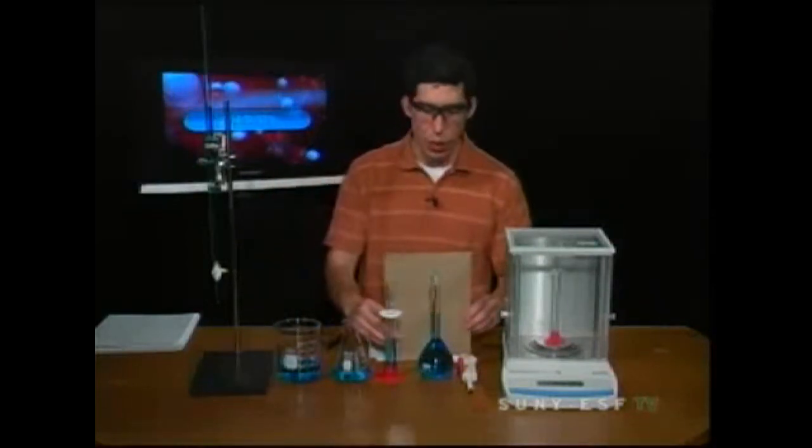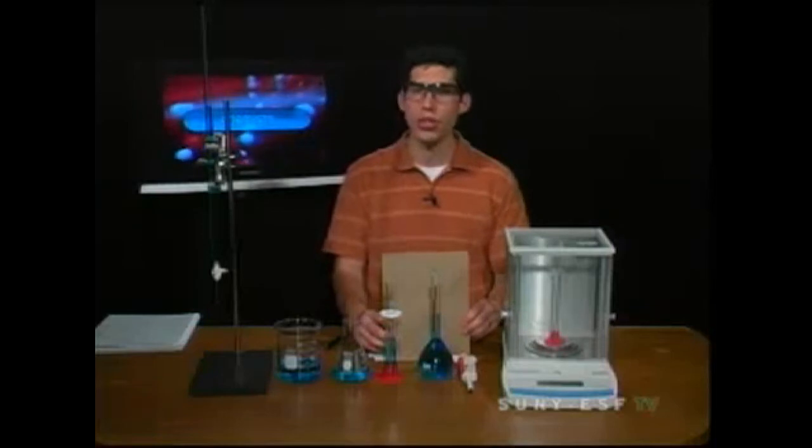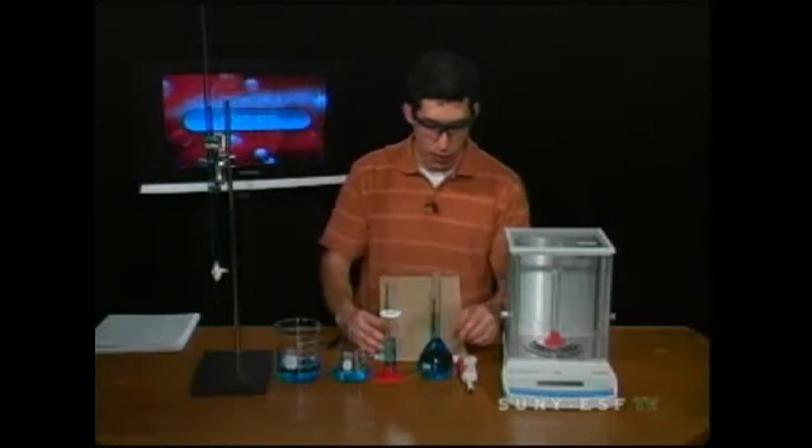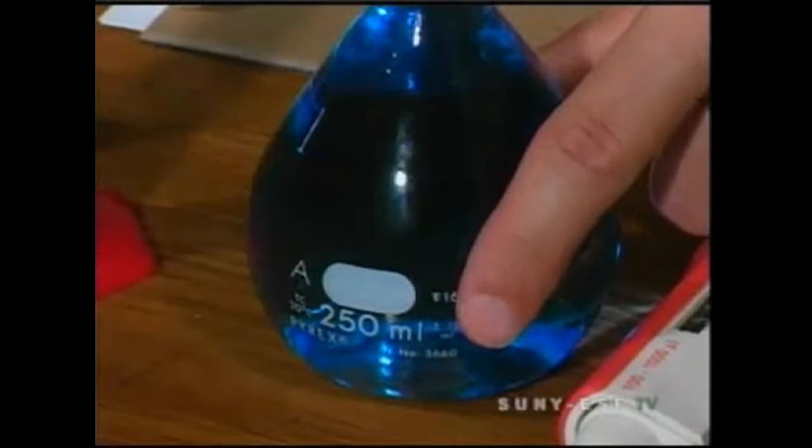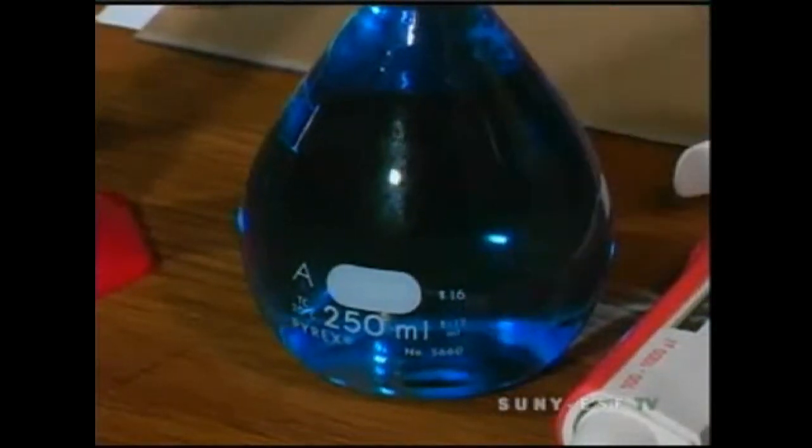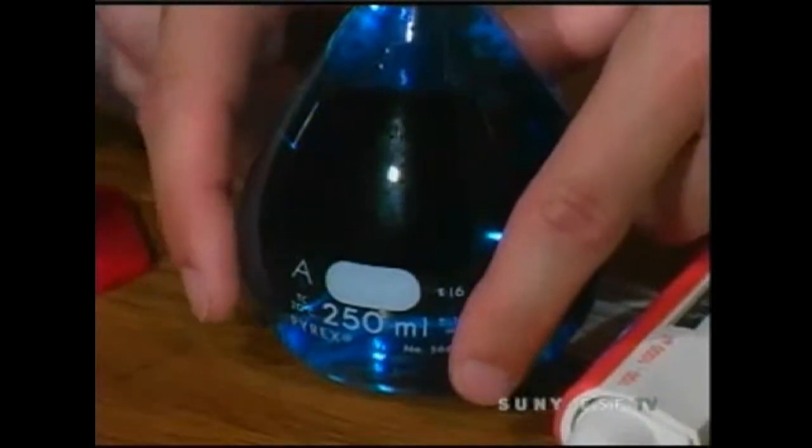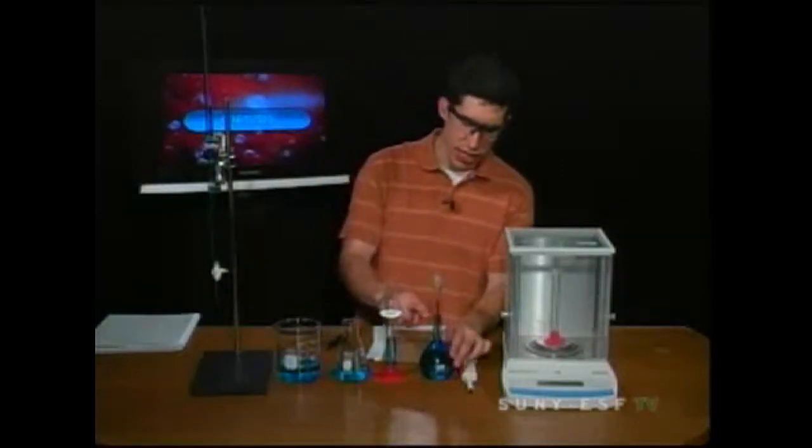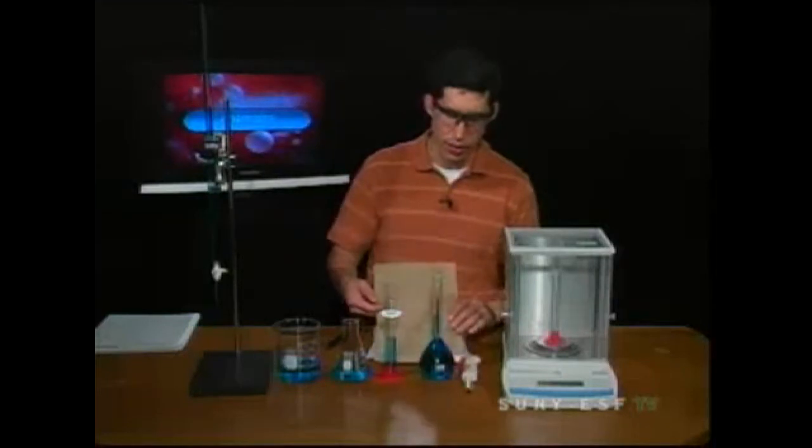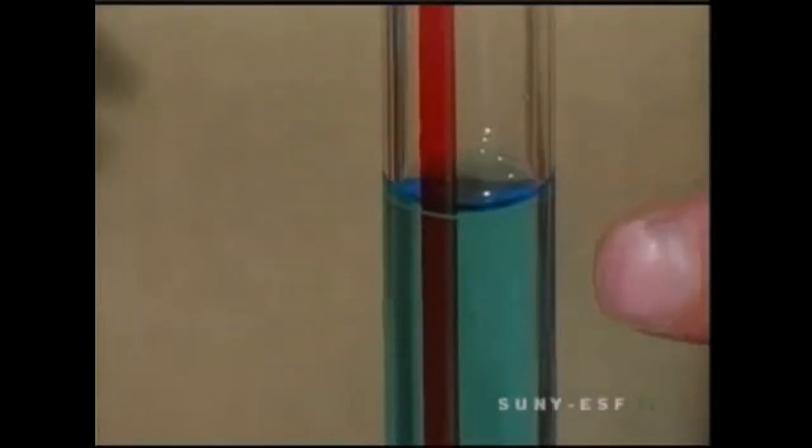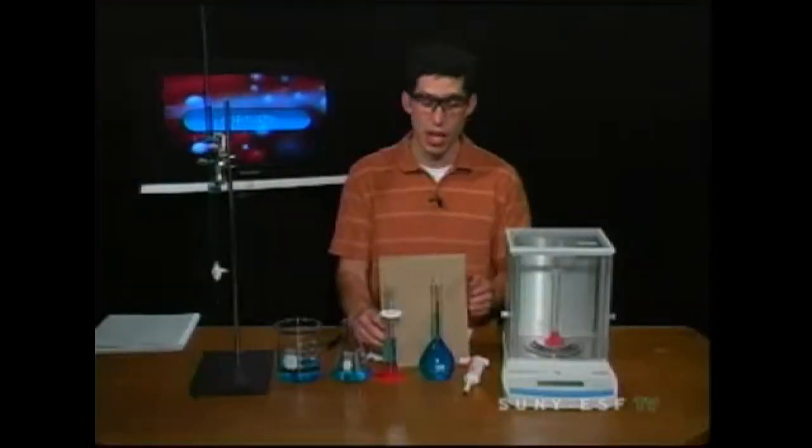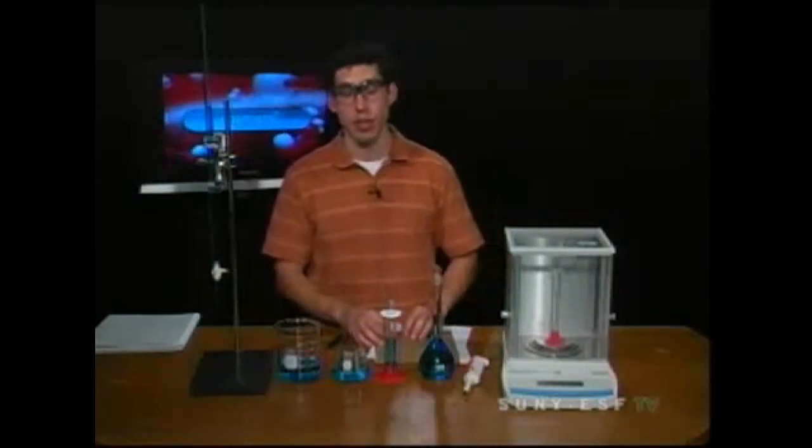As we improve our accuracy, we turn to the volumetric flask. You're going to use this when you're measuring concentrations and trying to get an exact concentration of a solution. We see that on this volumetric flask, it's marked as 250 milliliters. And again, we have that 20 degrees C mark on the bottom here, meaning that it's been calibrated at 20 degrees C. The way we know it is accurate is we look at this little grooved line here. I'll again put the card up. This was a hand-etched line, and that line is very, very accurate. It tells you exactly when you've reached the volume of the flask. Since this is a 250 milliliter flask, we know that line tells us that we're at 250 milliliters.